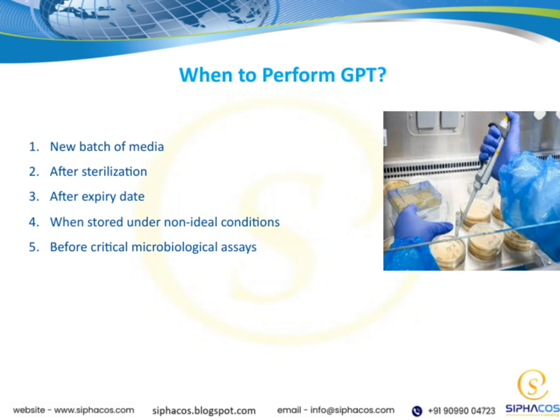Another important point is when the media has been stored under non-ideal conditions, such as temperature fluctuations or humidity, which can affect its integrity. Lastly, before conducting critical microbiological assays, performing GPT ensures that the media will support the growth of microorganisms and provide accurate results.